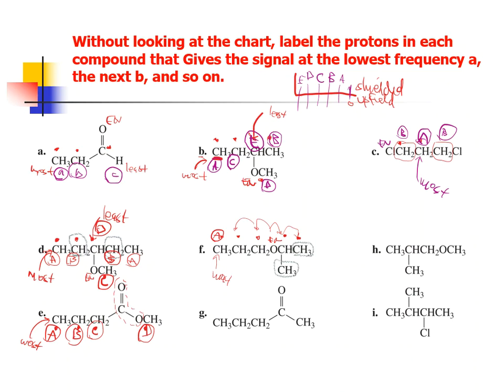So that means that out of those 2 choices, the CH3 would actually be the next in line. And guess what? These 2 things are equivalent, so I'm going to put B's on both of those because they're the same. And then C will come here because that would be the next in line. All right, so now what I've got left over are 2 more signals, one to the left and one to the right. The signal to the left is 1 carbon away. The signal to the right is 1 carbon away. So I can't really use that judgment call to go by.